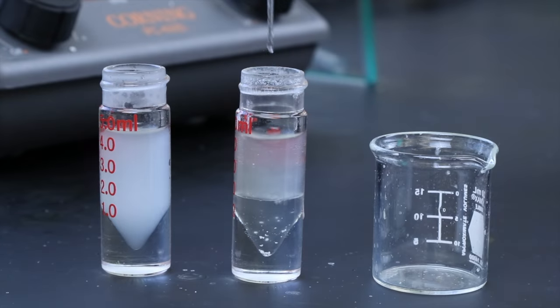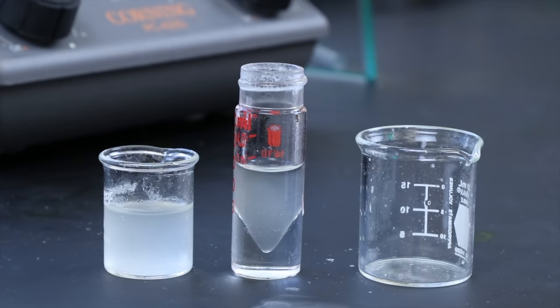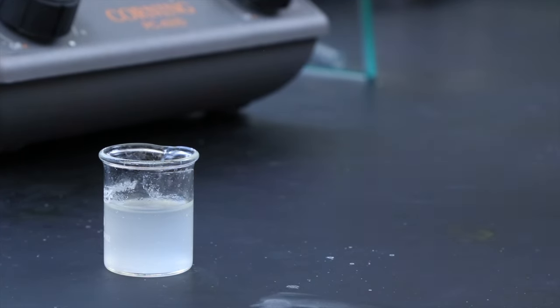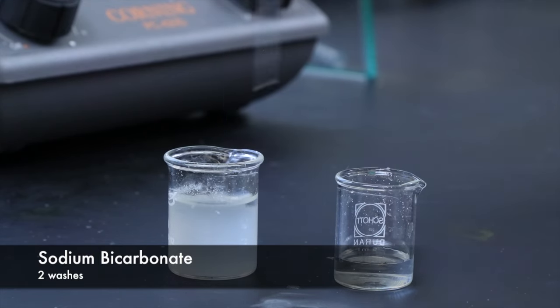I ended up having too much methylene chloride trying to dissolve the solid, so I transferred everything to a beaker. And now I can save the aqueous solution containing the acid product for later and move on to the sodium bicarbonate washes, which I'll be doing 2 of.